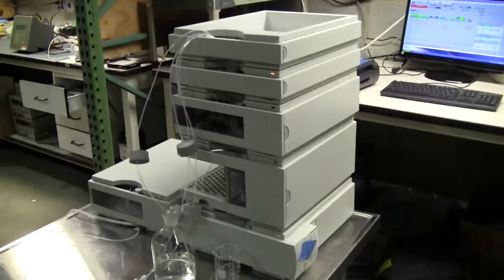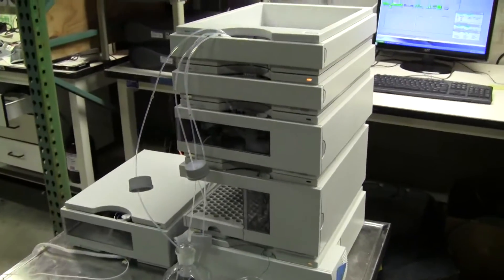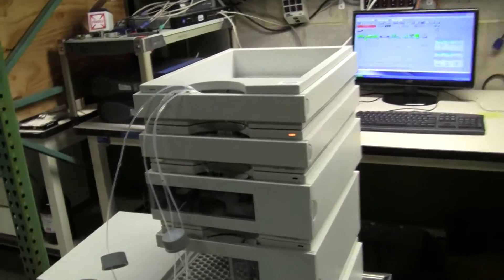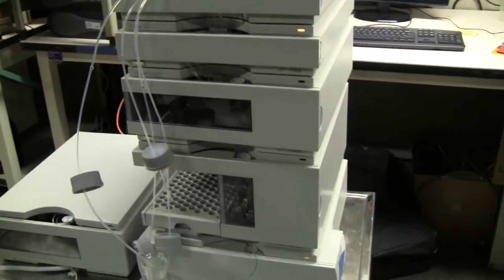Hi, this is Michael Natal from Hitech Trader. Today we're looking at an Agilent 1100 HPLC system.